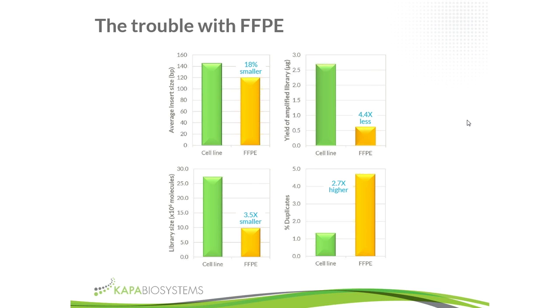And so the slide here summarizes pretty much what I think a lot of people are seeing with FFPE DNA. This is data that we've generated, average sequencing metrics for libraries generated from either 9 samples of DNA isolated from cell line DNA, so regarded as good quality samples, versus 8 FFPE samples. And this is all libraries prepared for targeted sequencing using a custom NimbleGen panel.